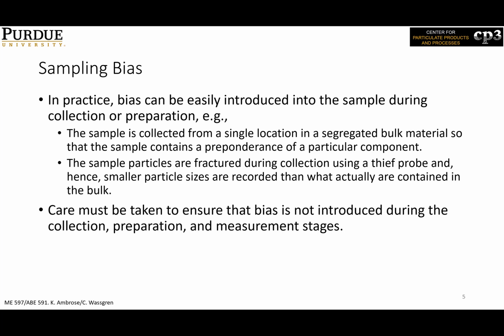The other major challenge will be the sample preparation error. For example, when you're preparing a sample for particle size analysis, excessive ultrasonic energy during liquid sample preparation or excessive air pressure during dry powder sample preparation can break down the particles. So you will not be able to rectify the sample preparation error by having a good sampling plan, and it will add to the sample bias or error in characterization.